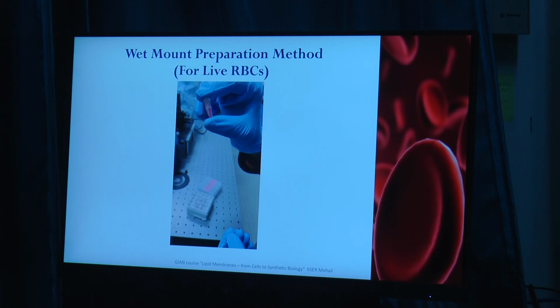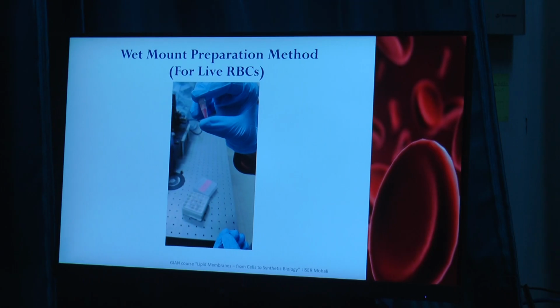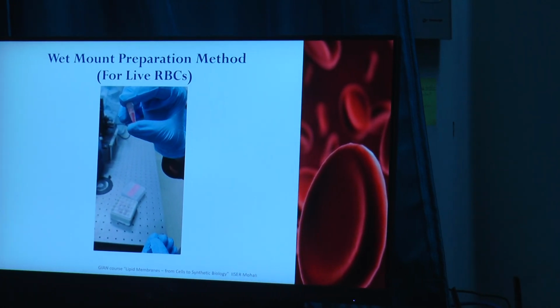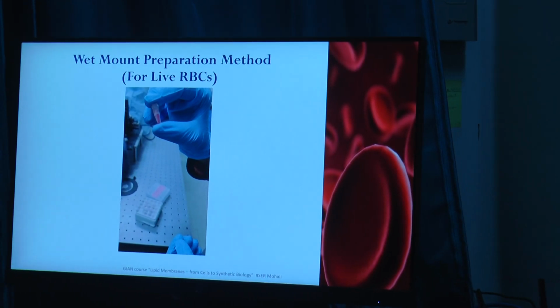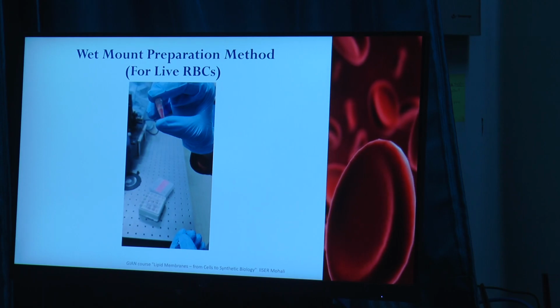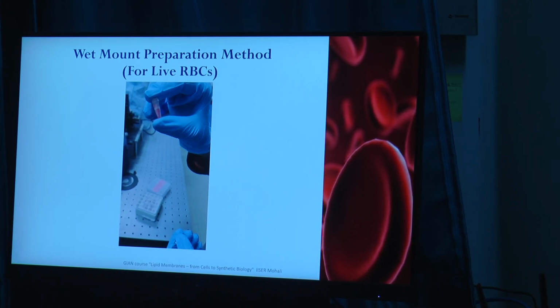Now I was telling you how many red blood cells there are when you take whole blood: 45% red blood cells. Depending on how many red blood cells you need in the sample, you dilute it using the buffer. When you are diluting using the buffer, you cannot put in any amount of buffer you want. You cannot take 1 drop, or 10 microliter, or 1 liter and all that. So there are particular reasons why we do that.